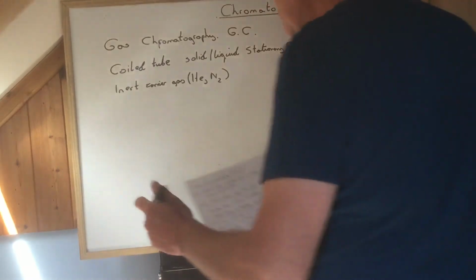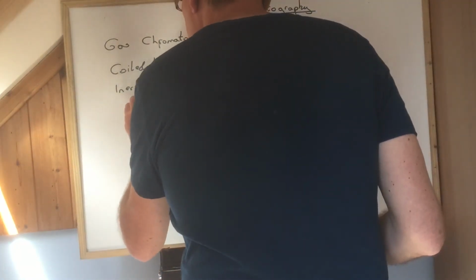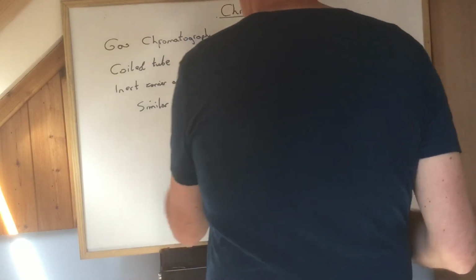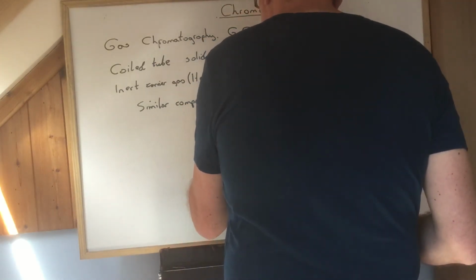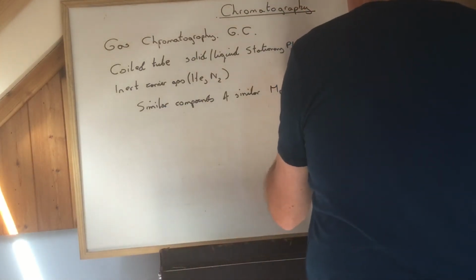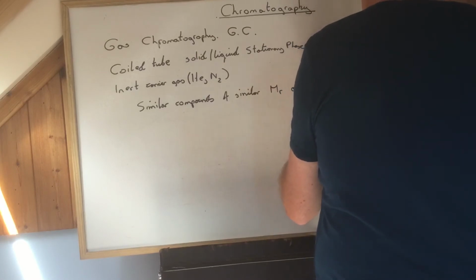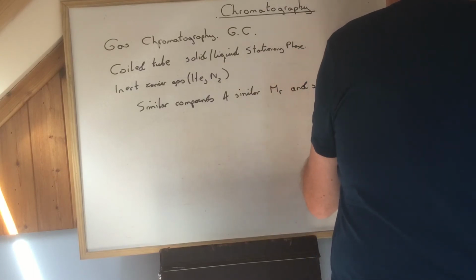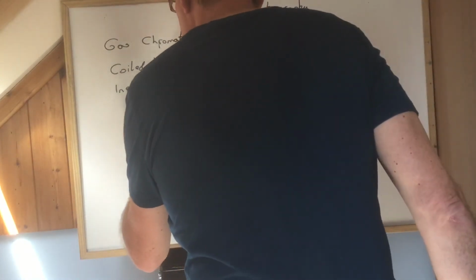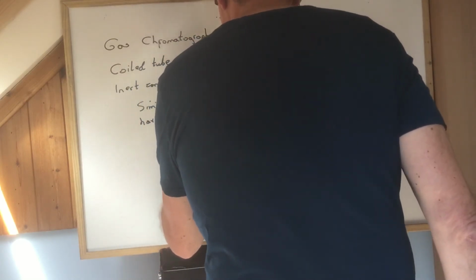All right, and what it comes down to is this: similar compounds of similar molecular mass and similar functional groups have similar retention times.